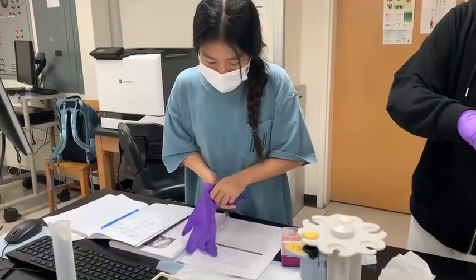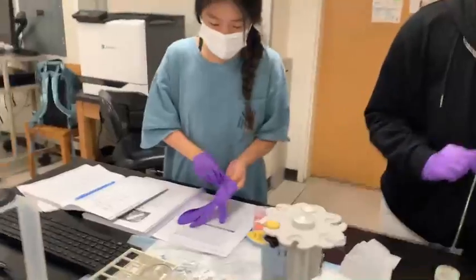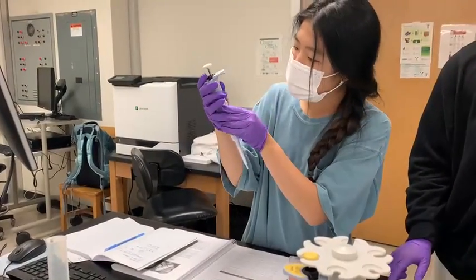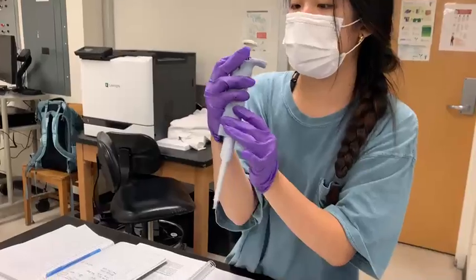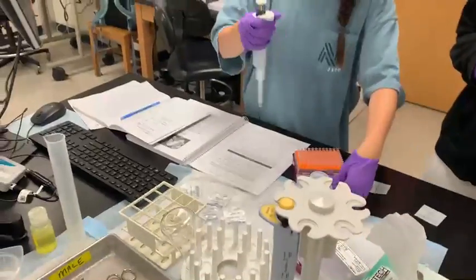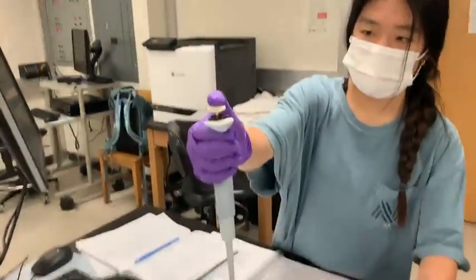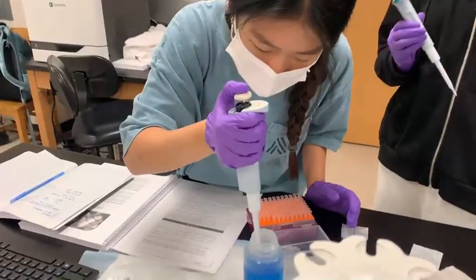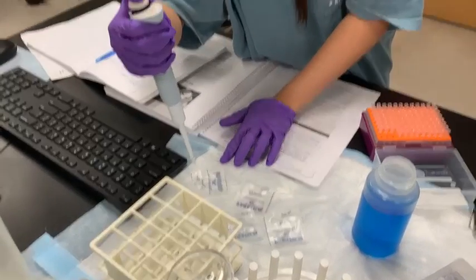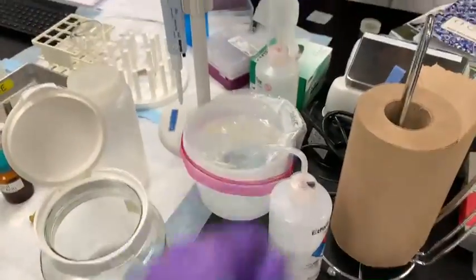Before I do it, I'm going to put gloves on. I'm doing the 9 microliters one, using the 0.5 to 10 microliters pipette. It is already set at 9. I'm going to lock it, then press to the first stop, fill that in, and then push it all the way down to the second stop.